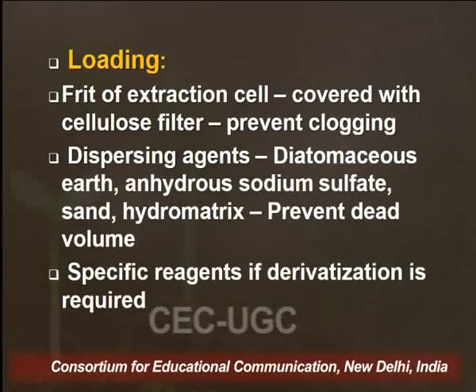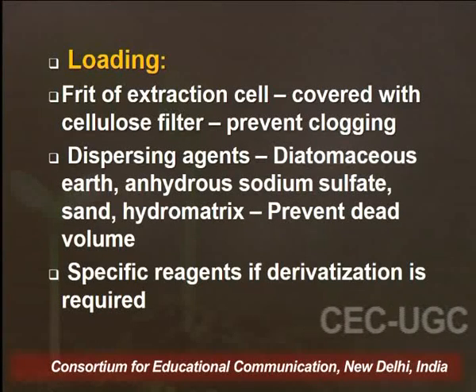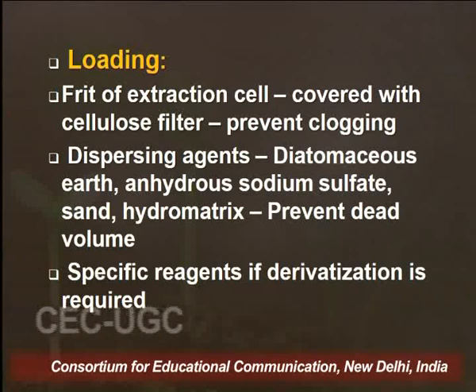Now uniform particle size will help you in uniform packing of the extraction cell, thereby causing a uniform overall extraction process. And then if you have a liquid or a solid-liquid mixture sample, then obviously you have to first filter the sample through centrifugation or by any other appropriate filtration method, or you can subject the sample to drying or freeze drying before you fill your sample into the extraction cell. Next step is the loading. Once your sample is prepared by drying, grinding, sieving or filtration, the next step is to fill your extraction cell with the sample.